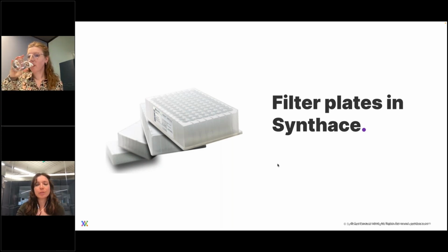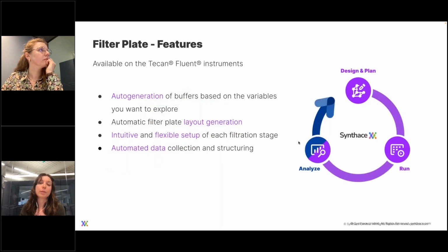And so pretty much as with any plate-based assay, you start thinking about what combinations of factors you want to explore and how many wells you're going to need for that. It's a lot of stuff you need to constantly edit yourself on. You constantly need to iterate. How many wells can I cut here? How many conditions can I include here? And it's really taxing.